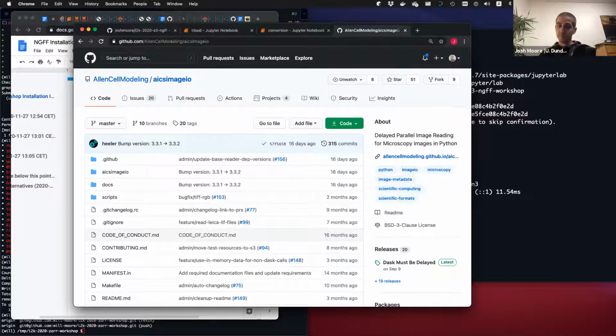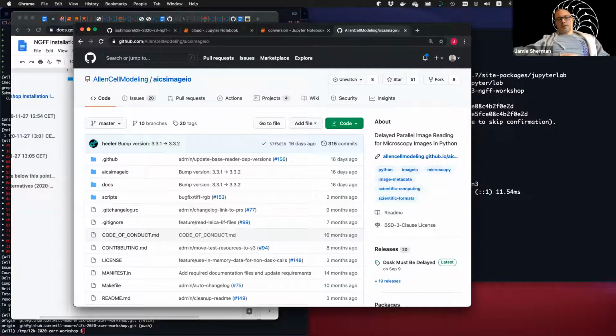Yeah, full stop. Also, sorry to throw this in here, but we are currently basically focusing on image formats that we use internally, like Zeiss CZI, 3i, etc. We're pondering adding image format support for Olympus or something like that.